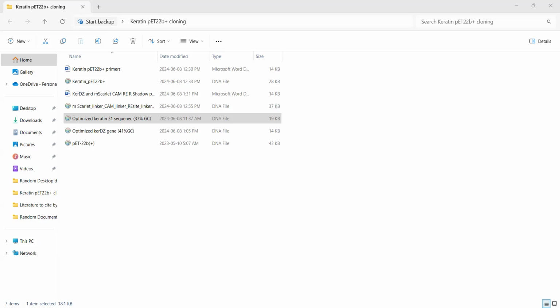Was it 20? I'm trying to see, because we already designed this primer, so it was 30. Sorry.